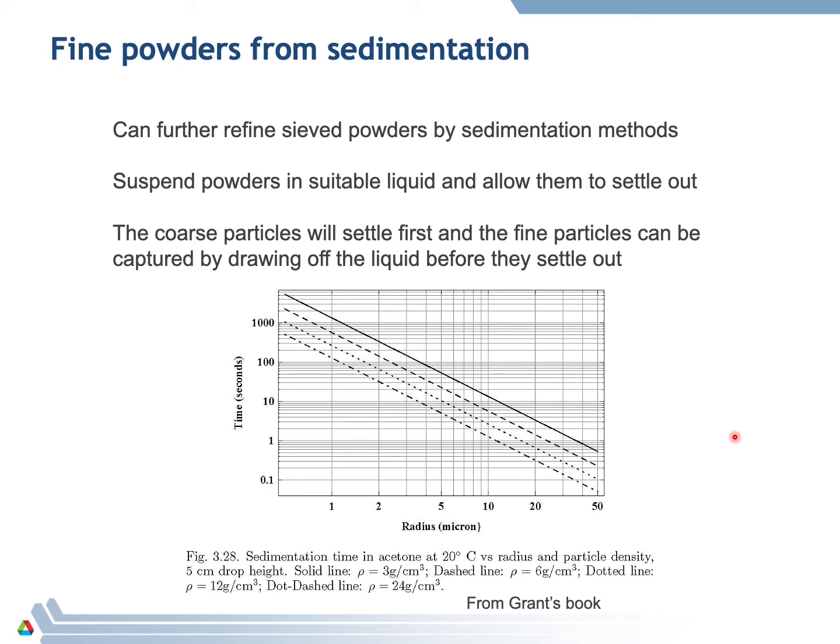Now, of course, the large, heavy particles will drop out very quickly, and the fine particles will stay suspended in the liquid. So after a certain time, you can draw off the liquid, let that liquid dry out, and you'll be left with the very fine particles.